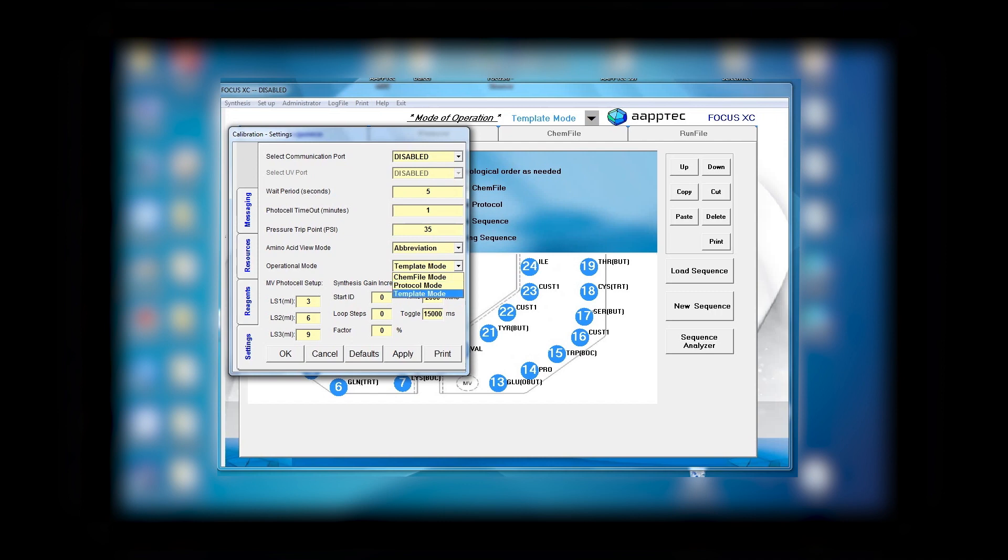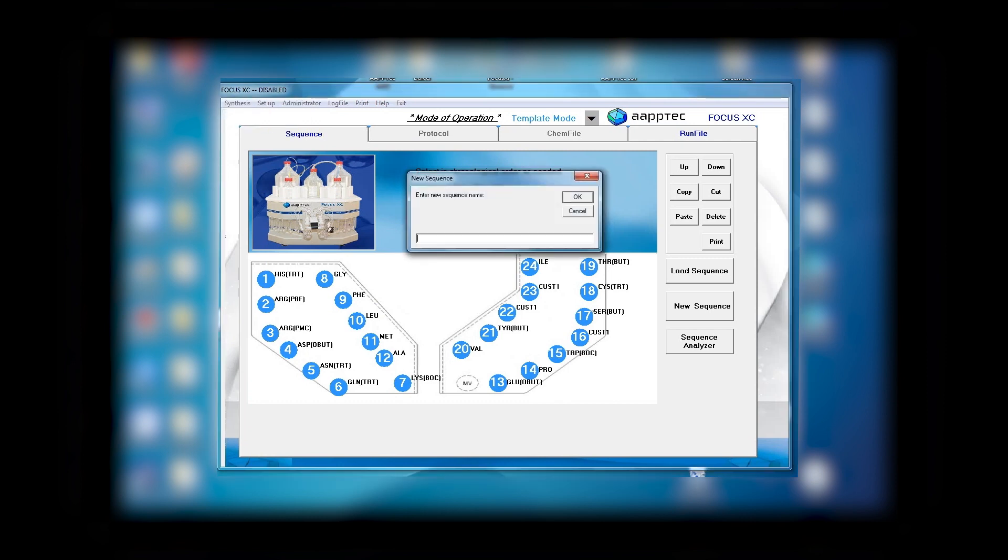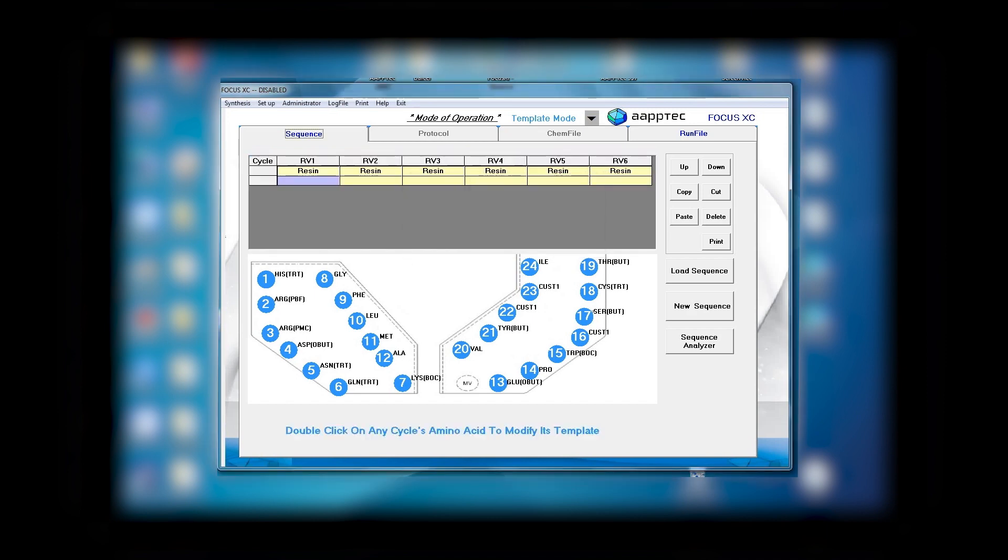Let's do the template mode first. You select template mode and click OK. Next we start the synthesis. Since this is a new synthesis, the first step is to name it. I will call it HS12345 in this example, but you can name it whatever you like. Then I click OK. The next step is choosing the reactor. This instrument has six reactors, but I am only going to choose one reactor.